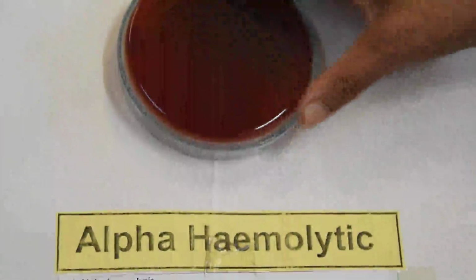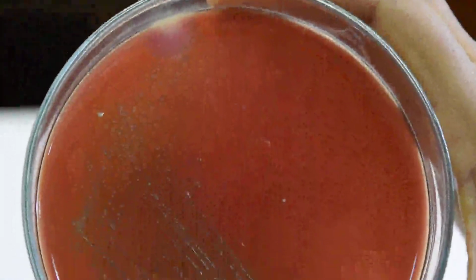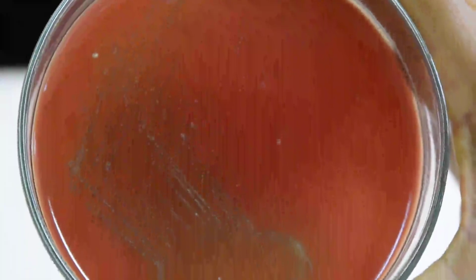Now when you come to alpha hemolysis, that is partial hemolysis. Unlike beta hemolysis, the organism cannot hemolyze fully. So there will not be a transparent zone around the colonies, but you will see some greenish discoloration around the colonies. That's due to the partial hemolysis, so you can't see through the hemolytic area.